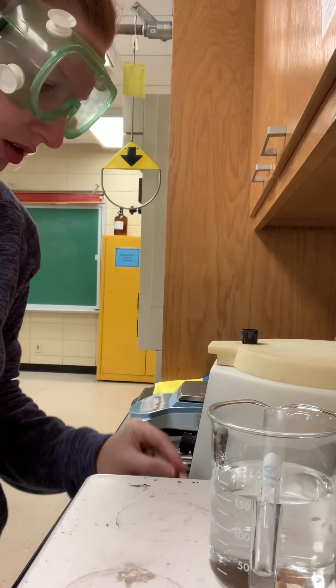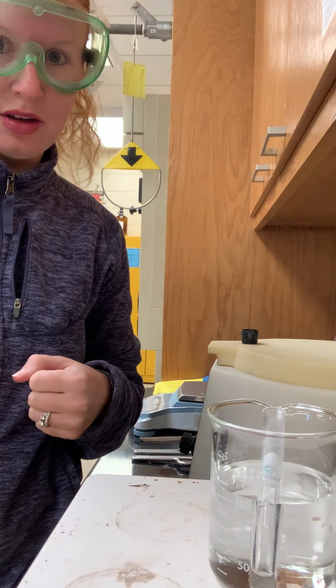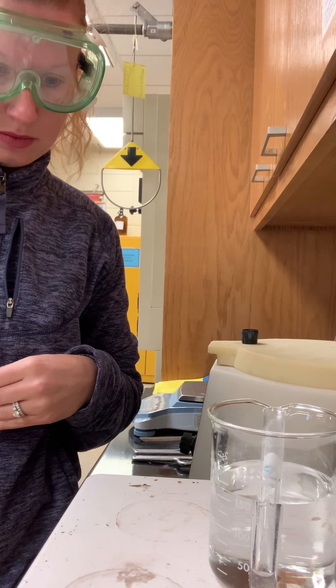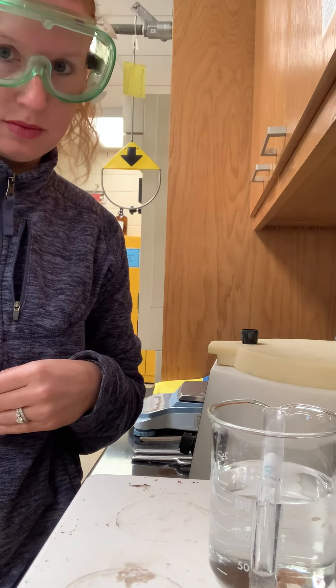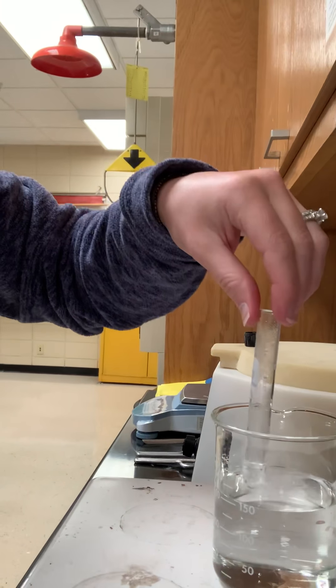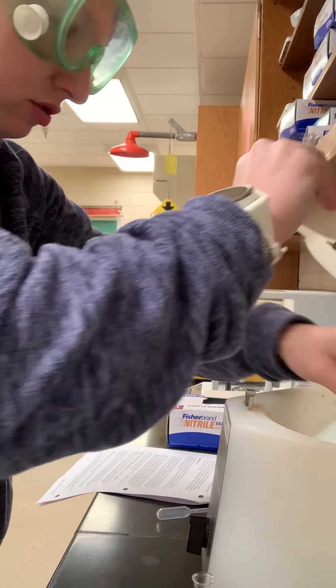Let's give it one more stir, and then we're going to centrifuge it again. It has now been about three minutes. That glass is hot. Let's send it back in the centrifuge.